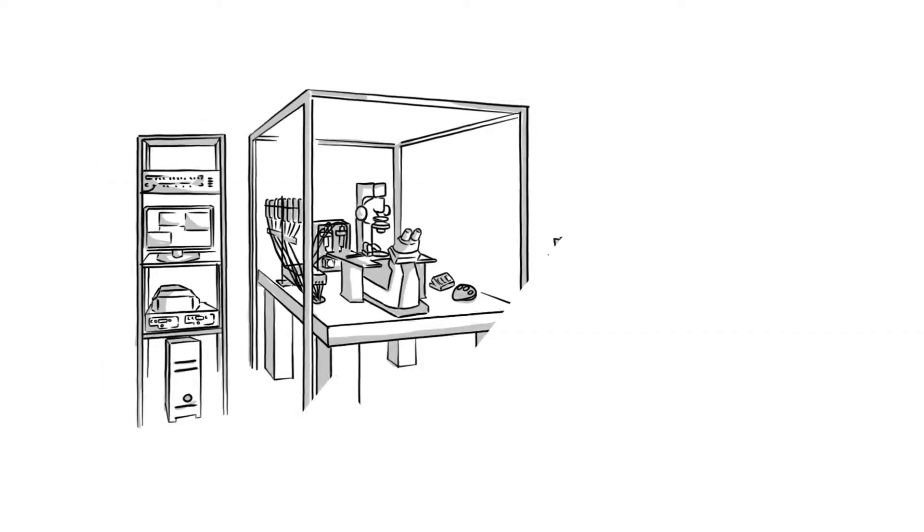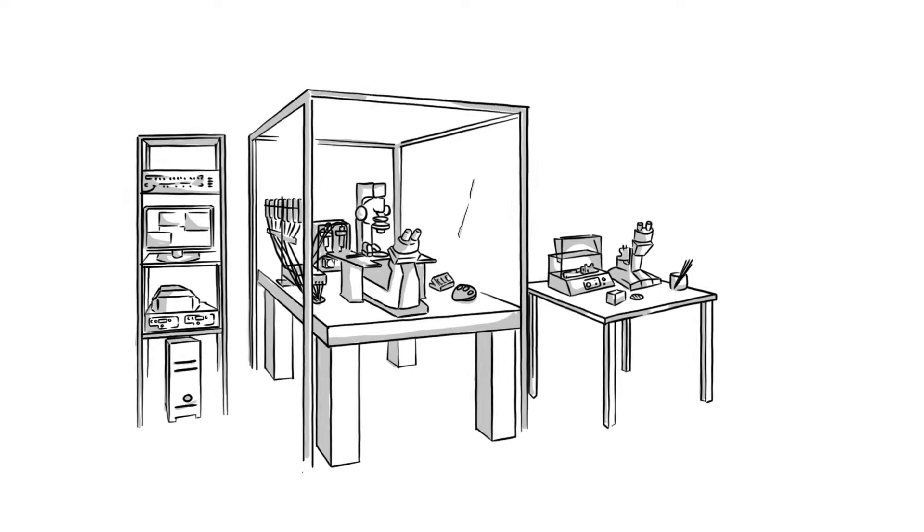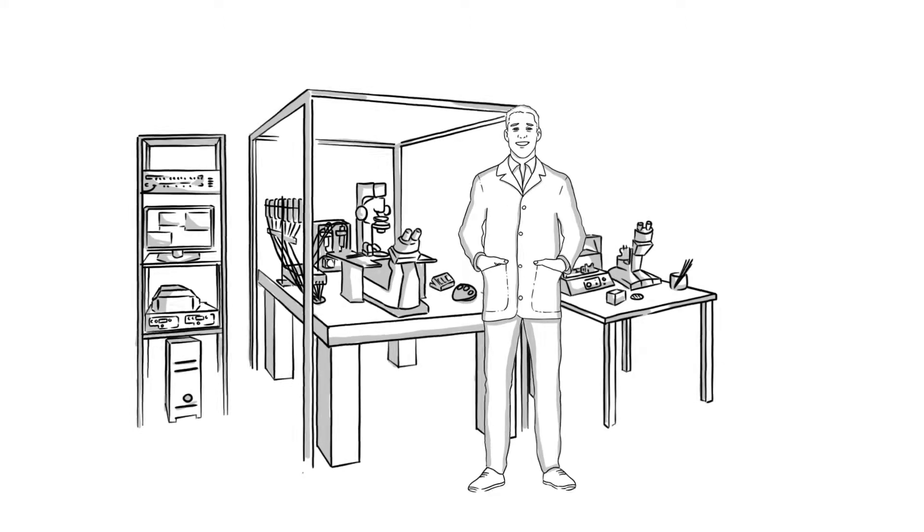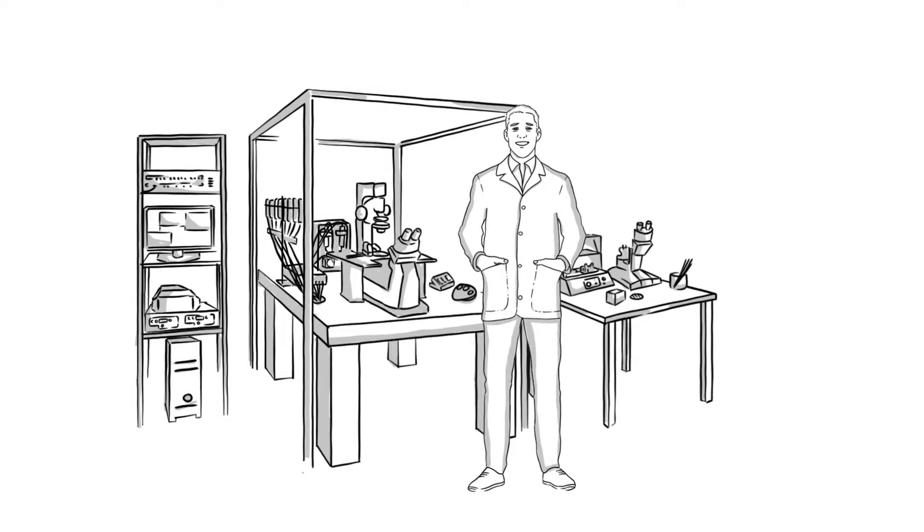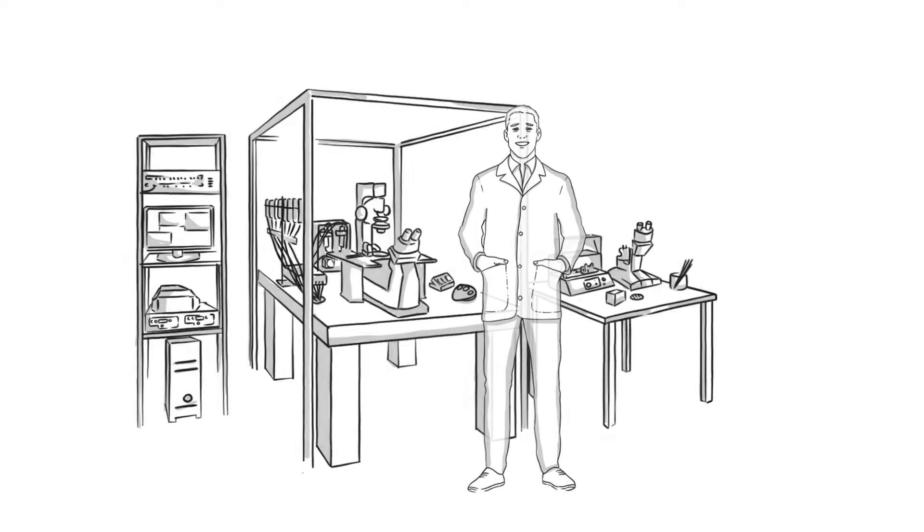This requires a large, complex, and costly setup. Steve also needs plenty of time to prepare for and perform the experiments.